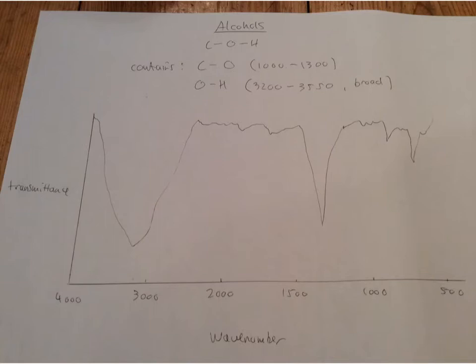If there is a C=O bond, then the OH cannot be an alcohol OH because alcohols do not have C=O bonds. It must be a carboxylic acid OH. Now, we do not have a peak at 1640 to 1750, so this cannot be a carboxylic acid, it must be an alcohol OH. That's how you tell. You can't tell what your OH peak is from how broad it is, because how broad's broad and how broad's very broad, and you can't tell from the wave number, because they overlap, they're too close.